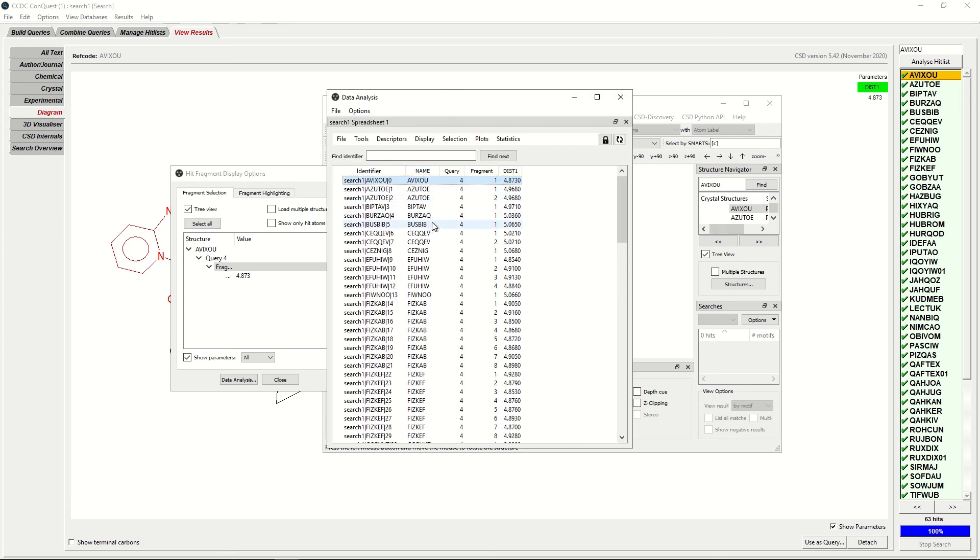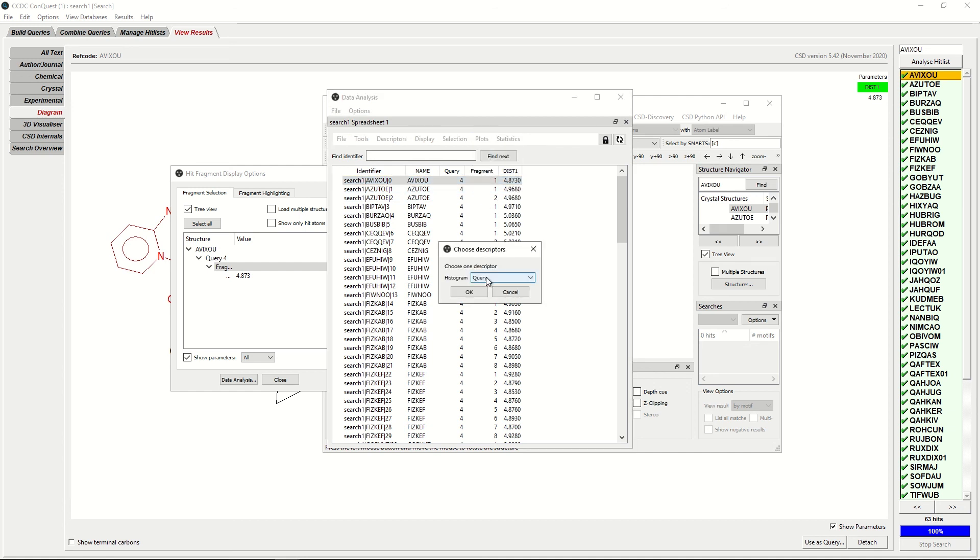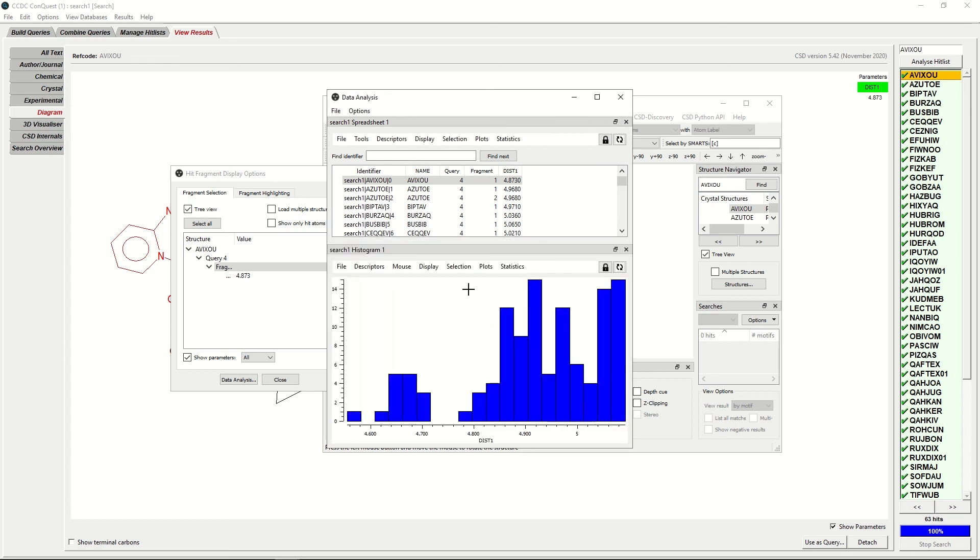If you'd like to make a plot of all of the distances between the centroids, you can click Plot, Histogram, and change the histogram to Dist1. You'll create a histogram of all the distances between each of the centroids of your hit list.